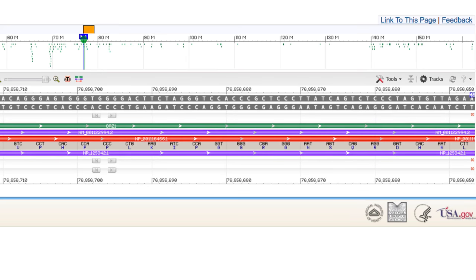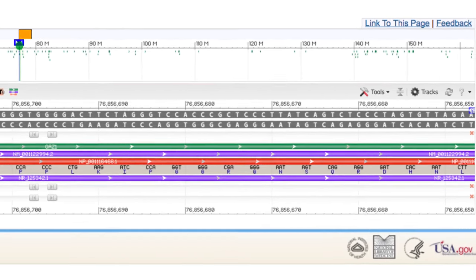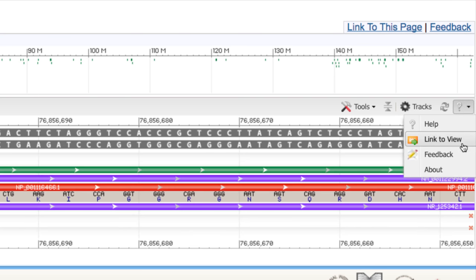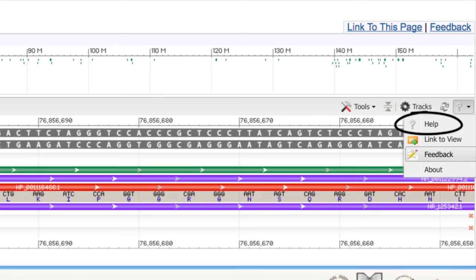That concludes this tutorial. We encourage your feedback, so please use the Help menu next to Tracks to let us know how we can make Sequence Viewer better. And find help including a legend for all Sequence Viewer tracks from this Help link.